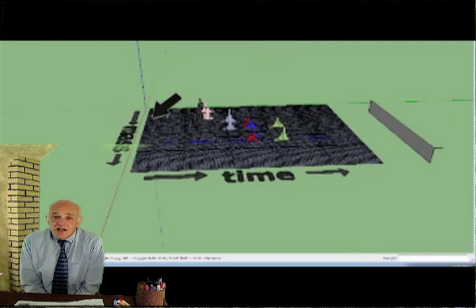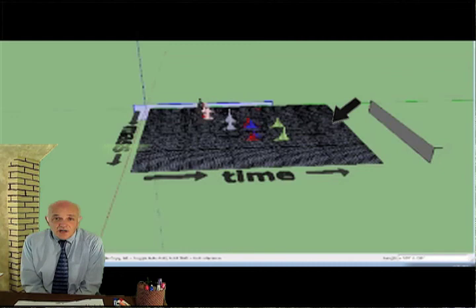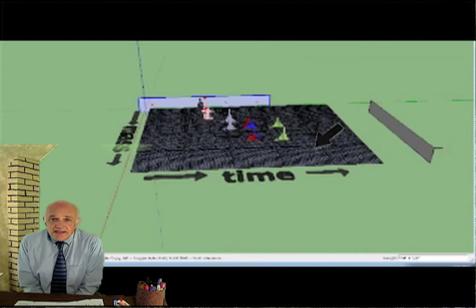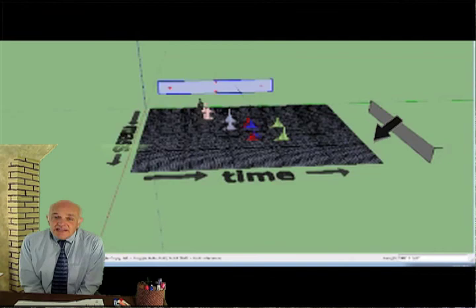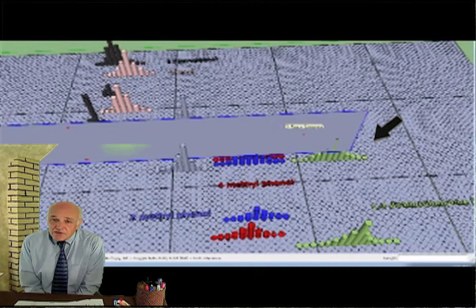And then a given ion is on this direction. So a typical ion, for example, this might be the 70 ion. This might be the 194 ion or something like that. The data is very complicated, of course. Computers are good at things like this, however. We can cut the data up any way we want using the computer. Let's say if we slice it up this way, we're basically looking at specific chromatograms of specific ions.